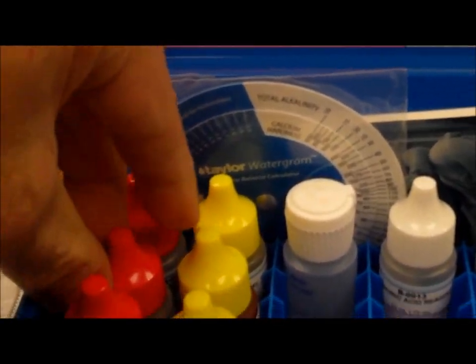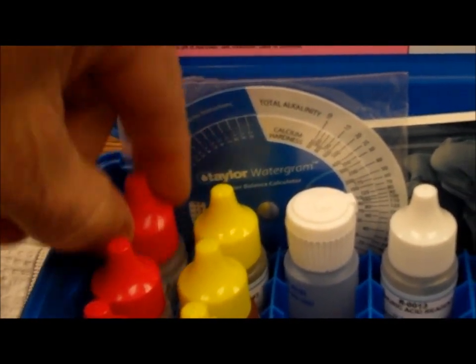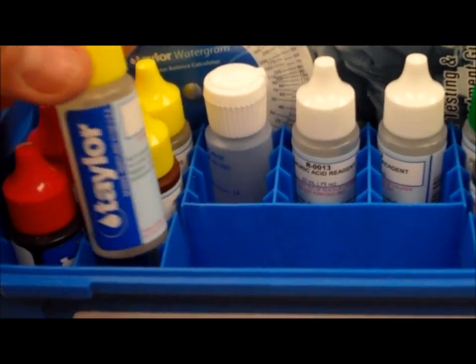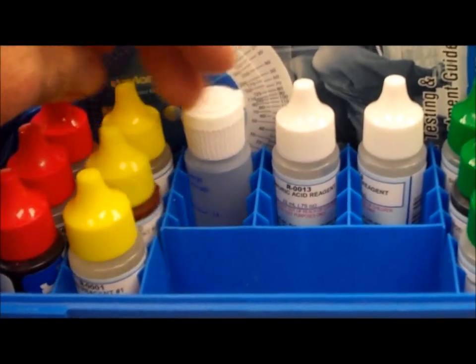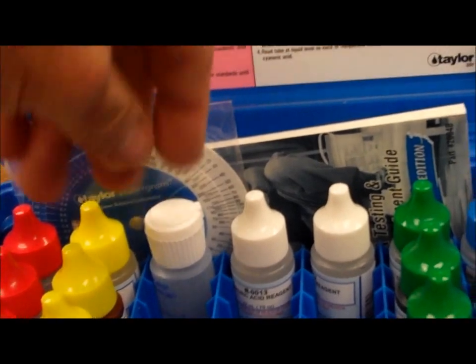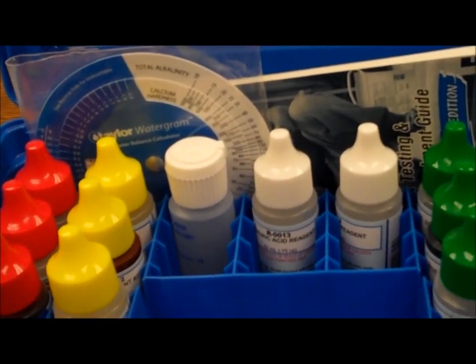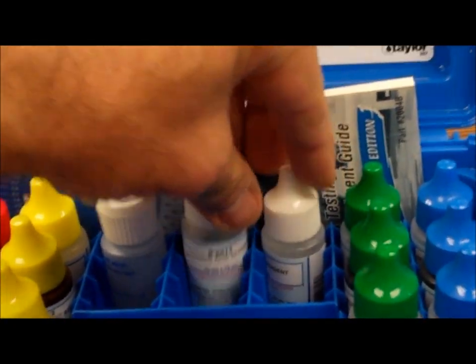The red bottles include your pH indicator, an acid demand, and a base demand. Then you have three DPD reagents — DPD reagent number one, number two, and number three. The white bottles across the middle are for testing cyanuric acid, the stabilizer/conditioner you put in the pool, along with the testing vial.